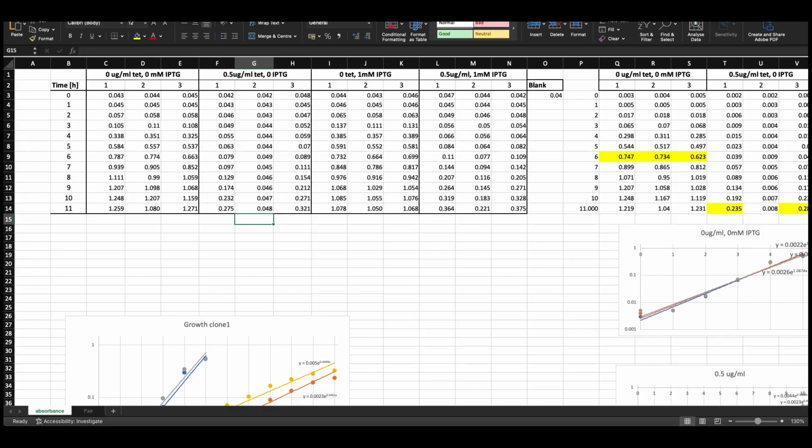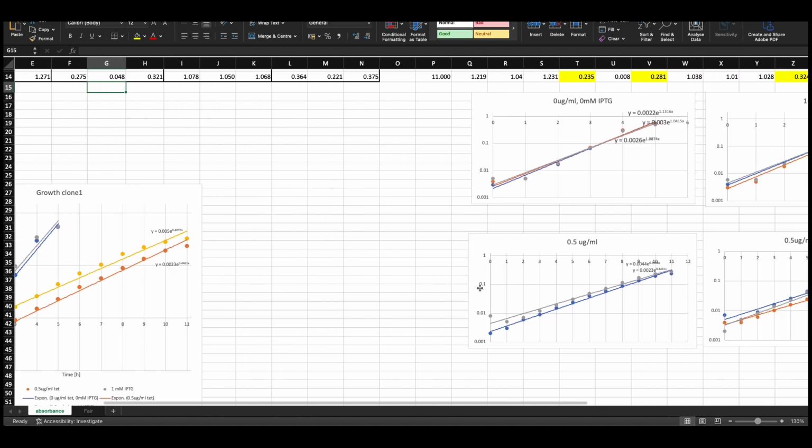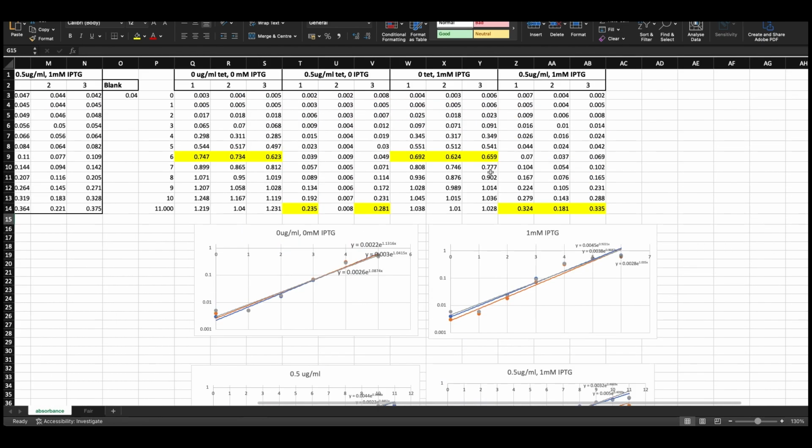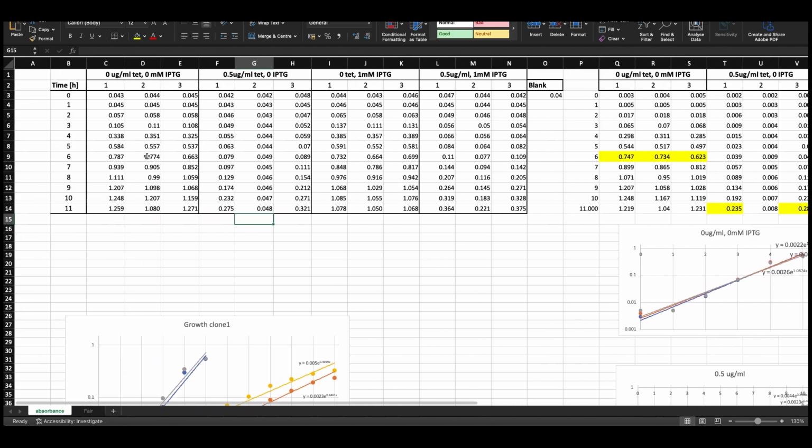So we have here, thanks to Roswitha, a data set that she provided with some absorbance experiment. It doesn't really matter at this point what it is, but what does matter is that if you wanted to put this as evidence for your article, you just provide this file that has also plots in it, and here a copy of this other table for some reason.